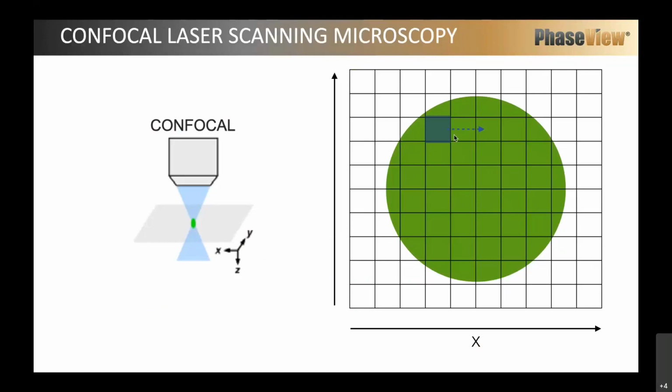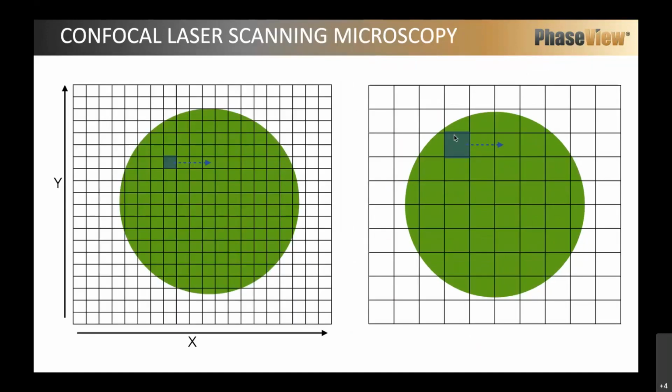It's interesting because we can choose the size of the pixels in order to have an optimal size for the lens we use. So if we have a really good lens with a really good numerical aperture, we can choose the optimized size of pixel for this objective. And so we can have a high amount of pixels. The disadvantage of this is if we have a big amount of pixels, we need to scan all these pixels. So it takes time.